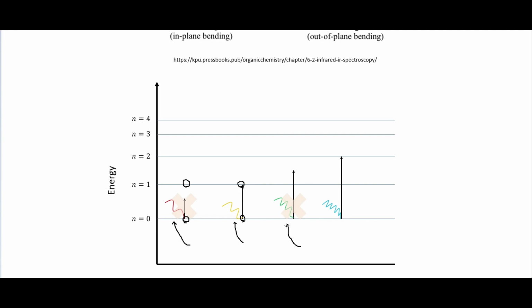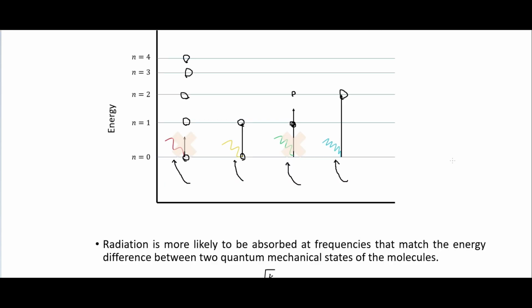Then if we have another wavelength that's somewhere in between the first excited state and the second excited state, then that will also not give a promotion. What we're interested in here is the fact that these are only going to be able to go to these various states at these certain levels. So things in between will not appear to be absorbed. So here I just show that this photon is enough to get it to the second excited state. And so those are the absorptions that we are interested in.